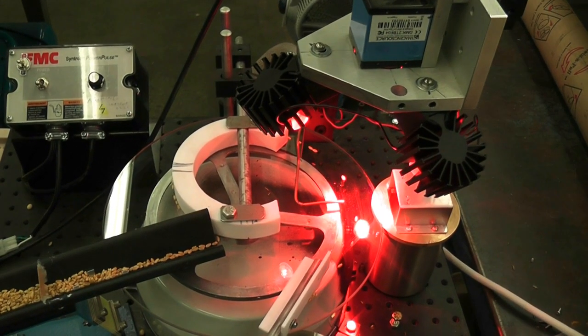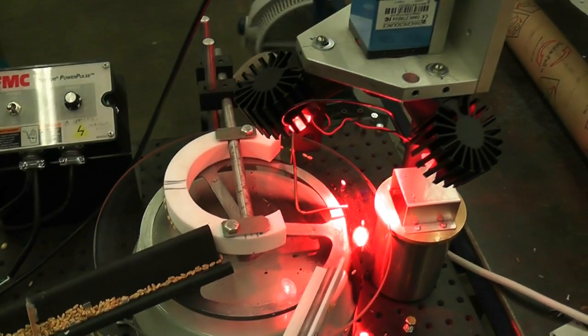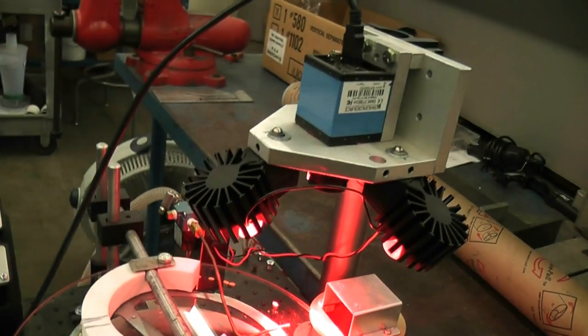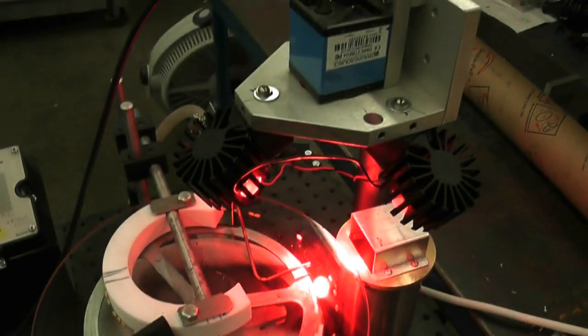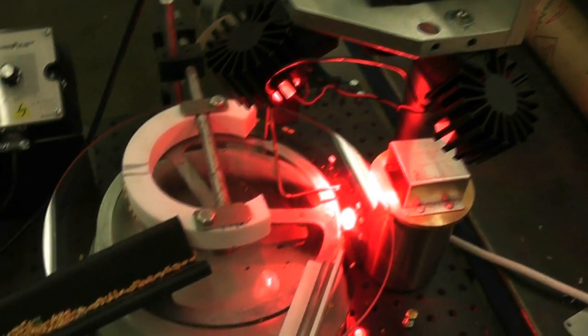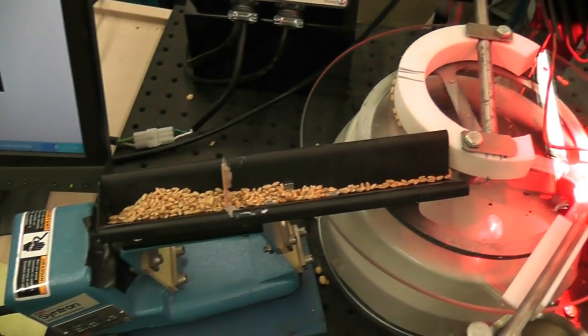Okay, here's the turntable sorter. Got a camera right there. Turntable there. Lights there. And a feeder there.